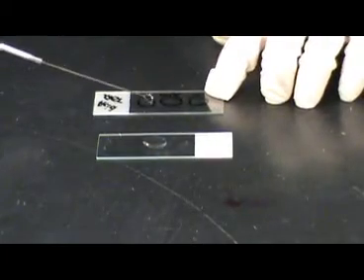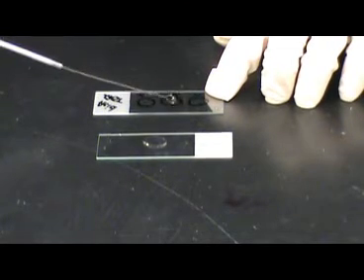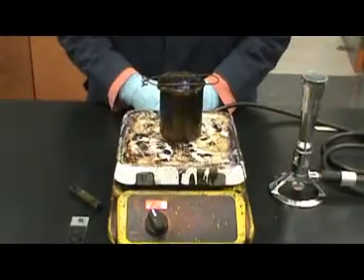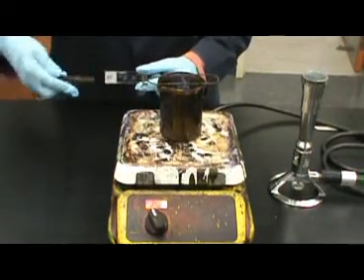Now, the Mycobacterium will be added to the positive labeled control circle first. Once the Mycobacterium has been mixed in that circle, the loop is then carried over to the mix and mixed with the Staphylococcus. After placing the bacteria on the slide, allow it to air dry. Once the slide has air dried, it should be heat fixed.